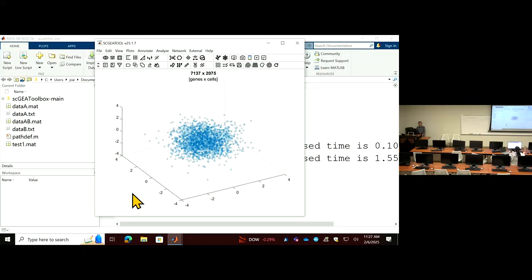But you don't want to have a significantly high proportion of reads mapping to MT genes. If you have an excessively high level of MT gene expression, it indicates the cell has been lysed. The mitochondrial membrane is not intact. That indicates the cell dies.